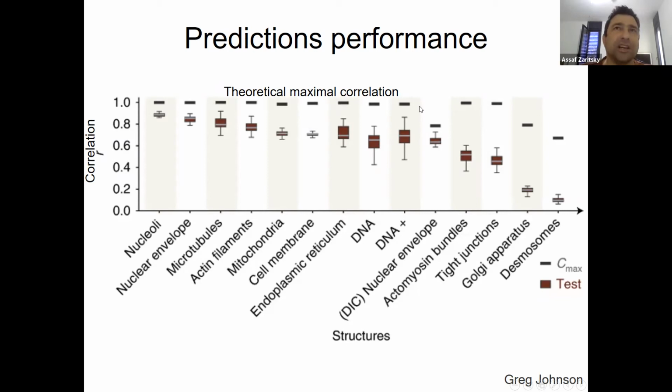It was pretty cool how they did it. They took the noise within their system, within this dye. So each of these has a different fluorescent marker, right? Each fluorescent marker has its own noise and background, the intensities that are disturbing. So what they did, they added the noise, based on what they know, to the ground truth image, and they showed how well it can be reconstructed. And this gives an upper limit. So it shows what our current results are, but how we can still improve.